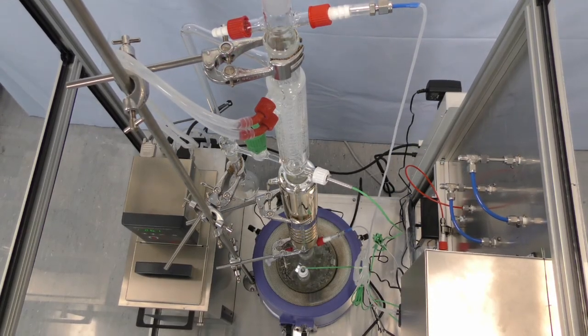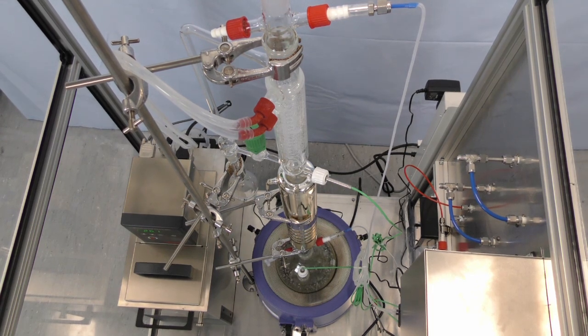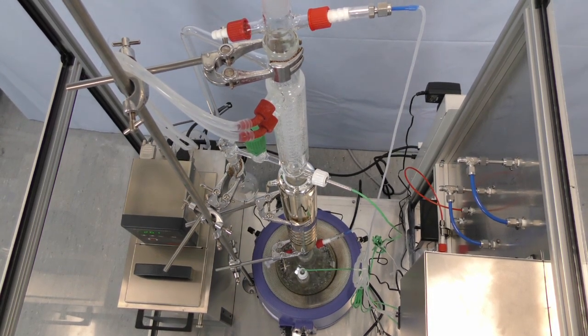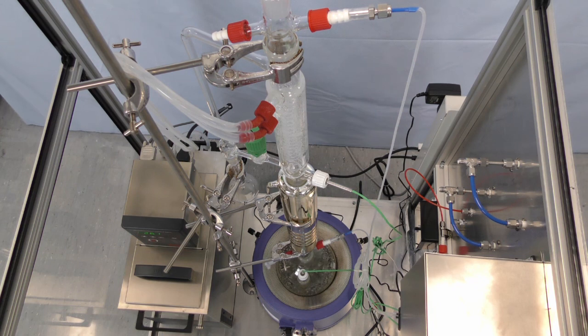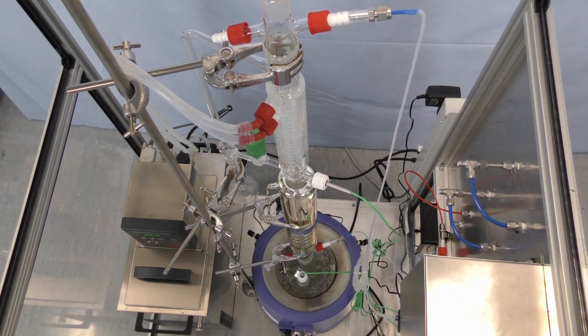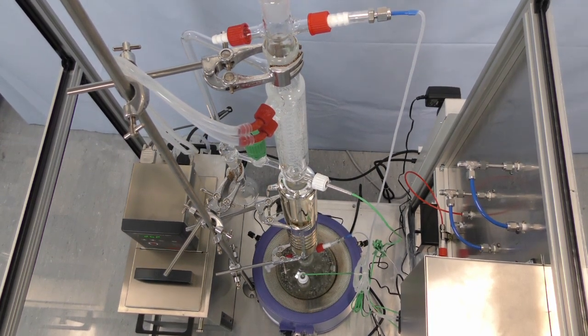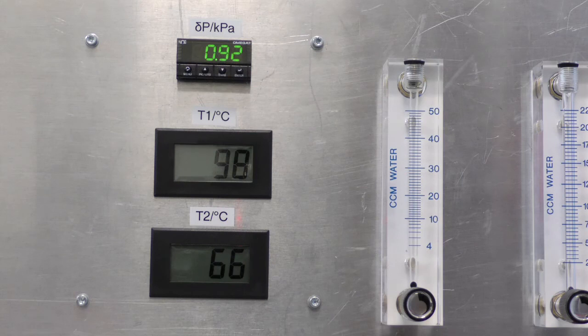Measurements of this type can be used to determine the overall column efficiency by comparing our still, comprising reboiler and ten sieve plates, with the number of theoretical equilibrium stages that would be required to achieve the same distillate composition given the same bottoms composition.